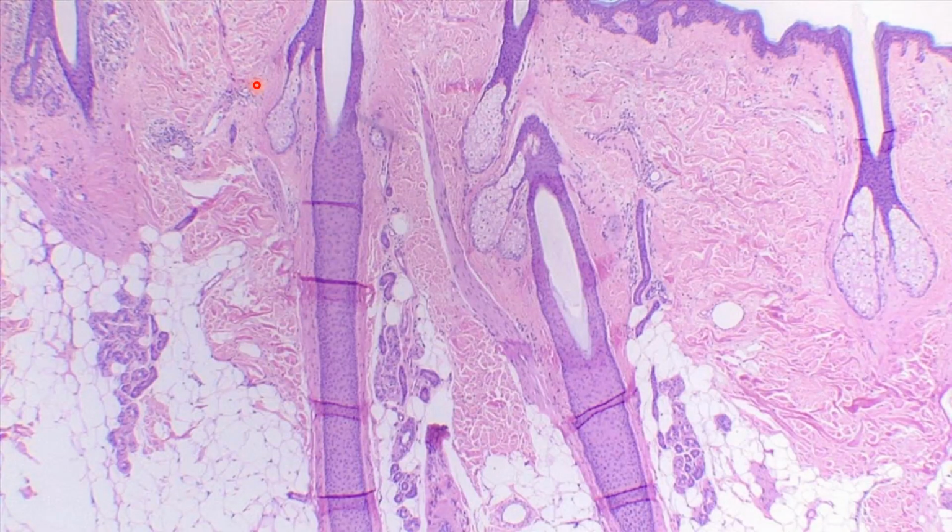Right here, again, you can see these sebaceous glands that are attached to the hair. This is where hair would be coming out. The sebaceous gland you'll always find right next to the hair follicle, so that's very easy. You can also see that adipose tissue right here that I was telling you about. So this would be a part of that subcutaneous or hypodermis layer.